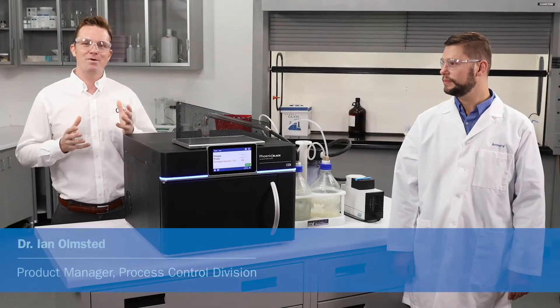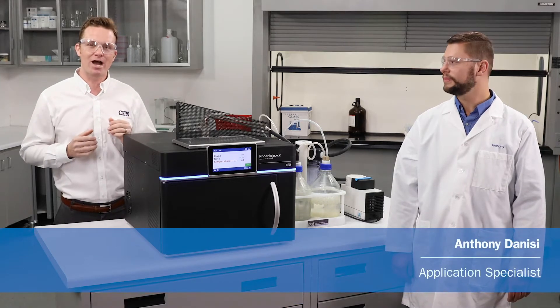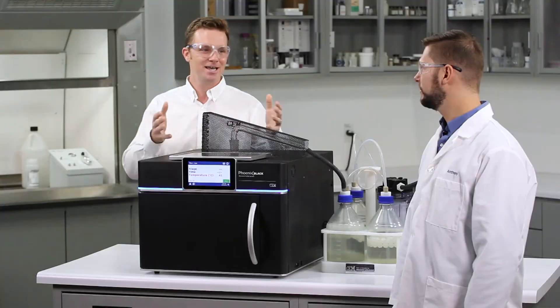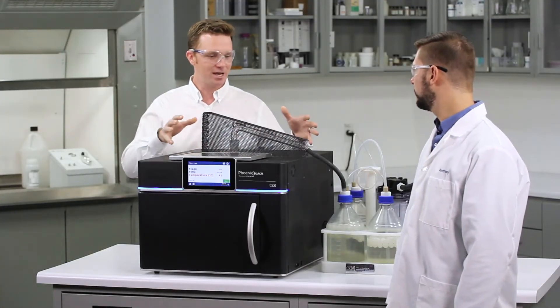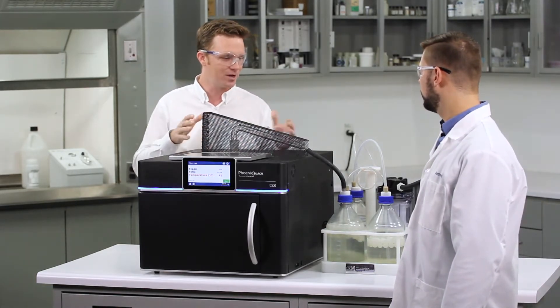Hello everybody and welcome to the lab here at CEM. Today I'm joined by application specialist Anthony Danisi and we're going to show you how to run a sulfated ash analysis in the Phoenix Black. So I see we've got the sulfated ash set up here at the Phoenix Black — this looks really familiar, but what's all this other stuff we've got going on here?